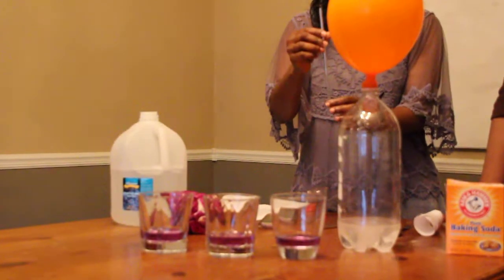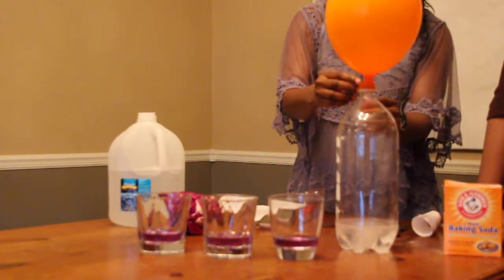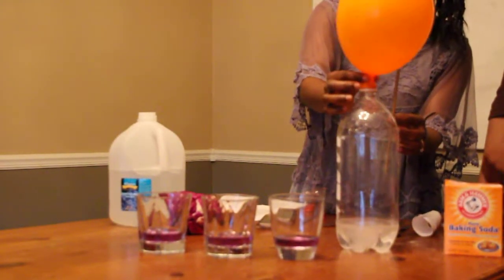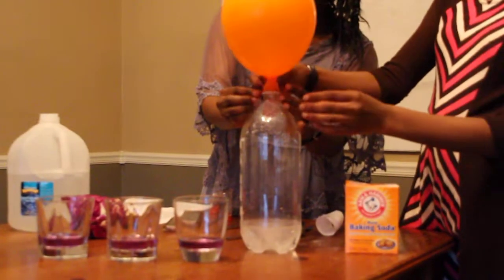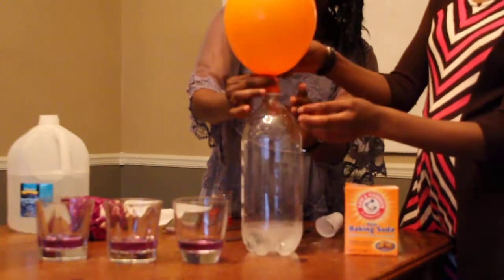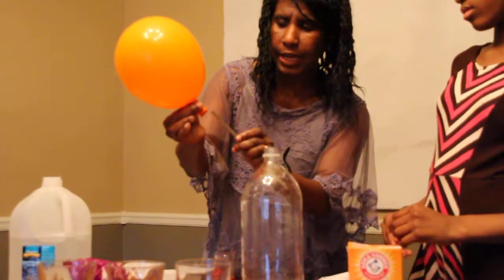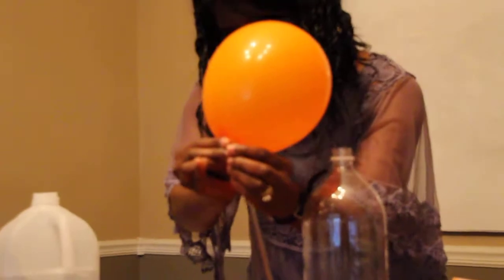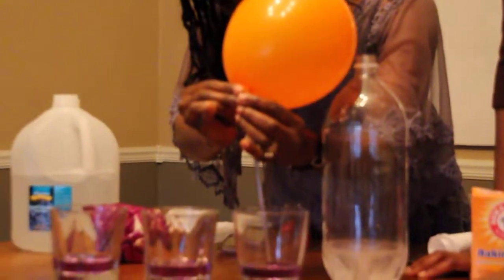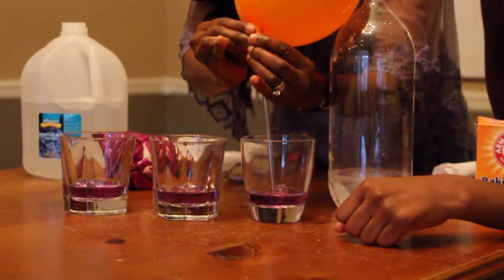We have a straw. We're going to take the shorter straw, and we're going to slowly see if we can capture all of the gas. All right, I'm going to pinch. Skylar's gonna remove the balloon. And you're gonna need to look very carefully at what happens in the water. See if there's anything that happens.